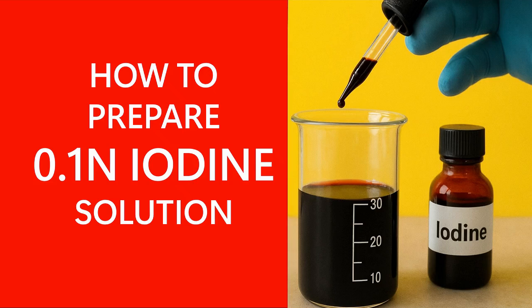In today's video, we will learn how to prepare 0.1 normal iodine solution. This video will cover materials required to prepare 0.1 normal iodine solution, calculation, procedure and standardization. So let's get started.